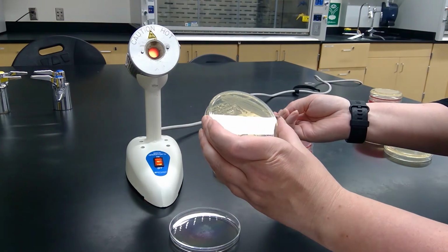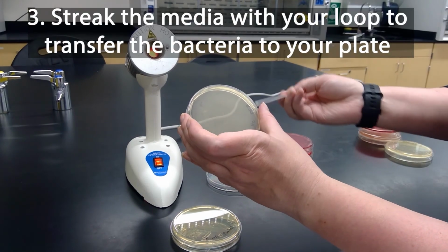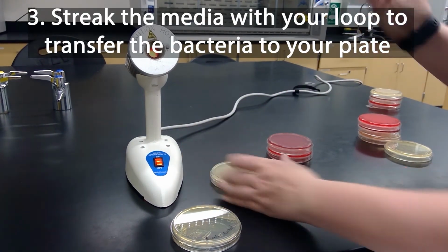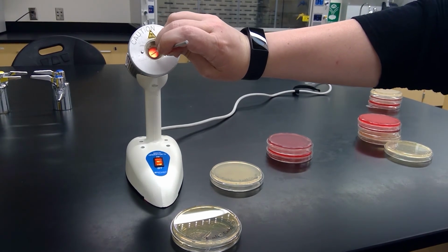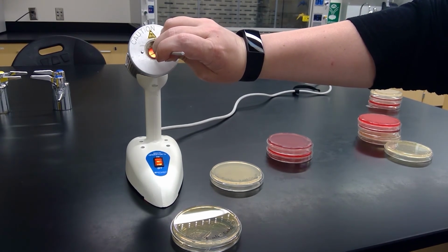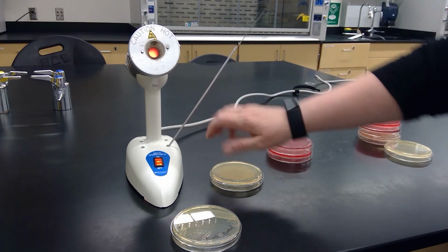Grab some culture, and then streak it onto our plate, and then sterilize your loop again. And then just let that cool.